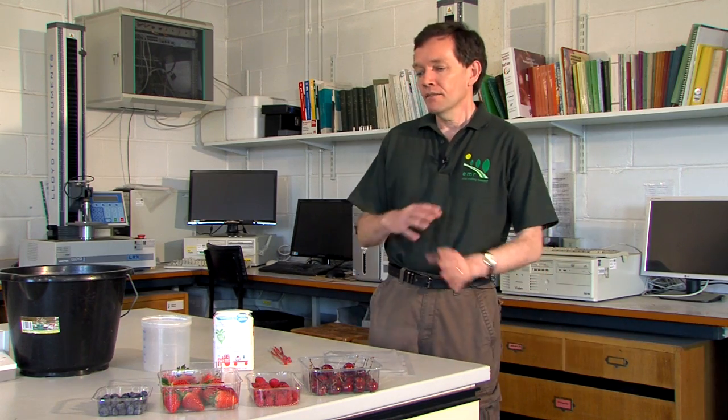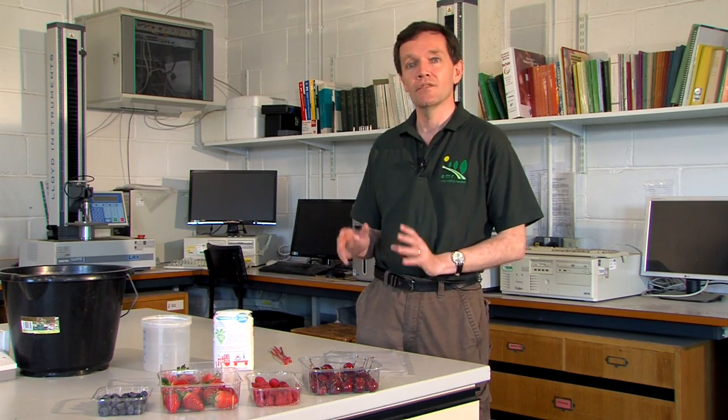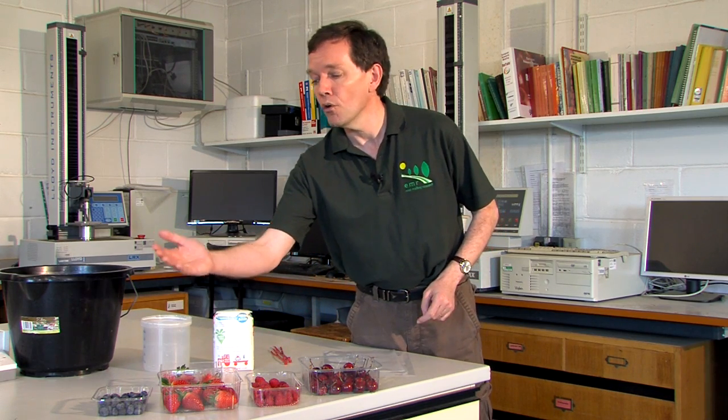Hello, my name is David Buss. I work here at East Morling Research. This is a technique for extracting spotted wing drosophila larvae from fruit using a sugar solution. The sugar encourages the larvae to leave the fruit so they can be seen. It works for cherries, raspberries, strawberries or blueberries.